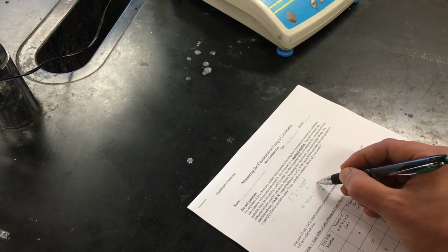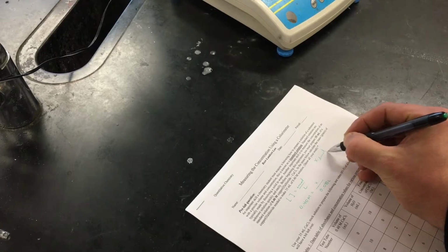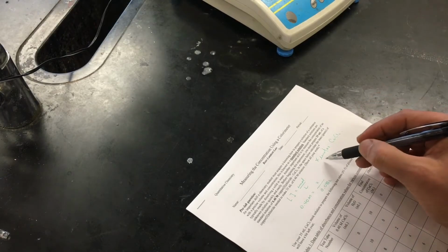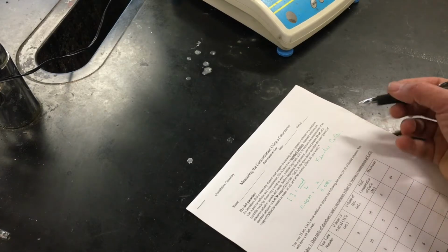So then we can find the number of moles that we need to prepare the solution. And once we have x moles of CuCl2, then we can take the moles and multiply by the molar mass of CuCl2 to get the mass.